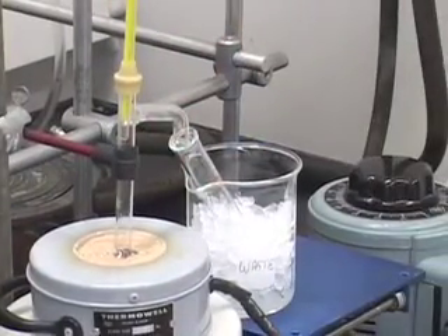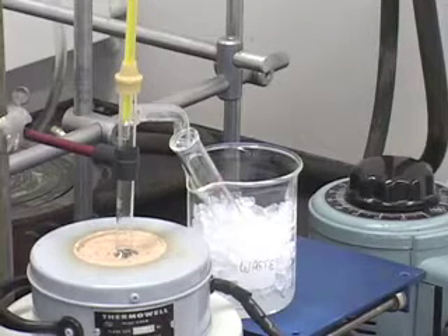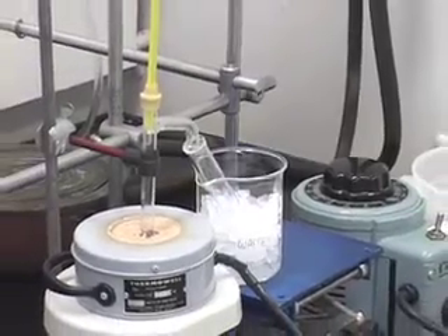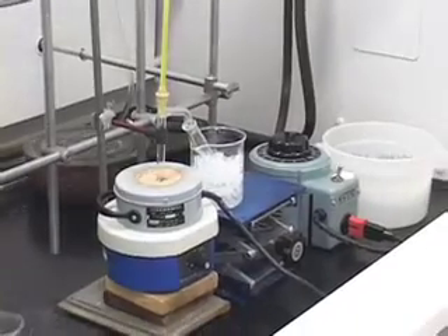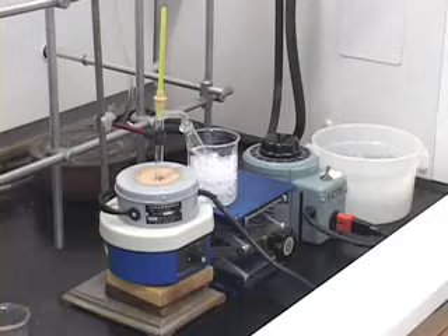After collecting the liquid in the reaction tube, we are going to do the workup. We used another chemical in this experiment — xylene — as a chaser solvent. So when do we add the chaser solvent?